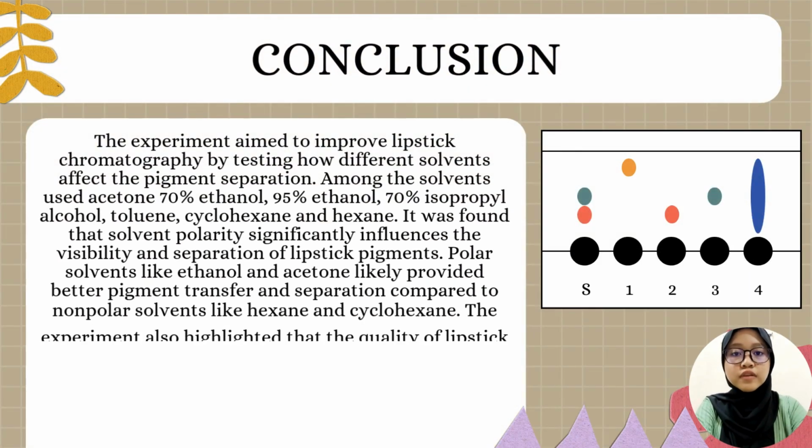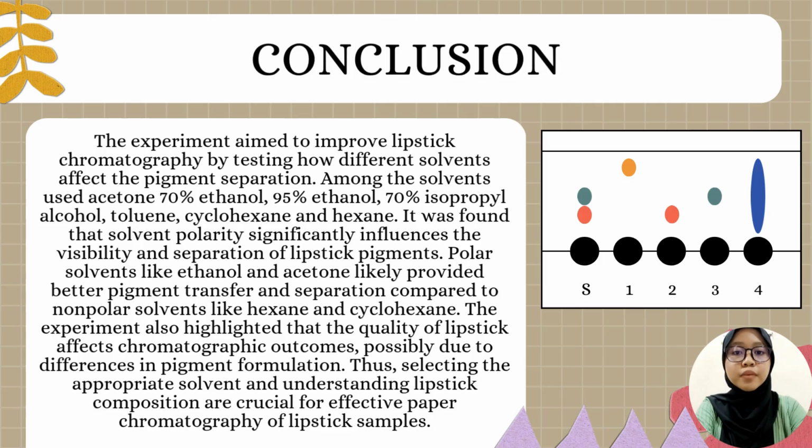In conclusion, solvent polarity and lipstick quality are both key factors in chromatography. Polar solvents like ethanol and acetone perform best, and high quality lipstick gives better separation. This experiment shows how important it is to choose the right conditions when analyzing cosmetic products using chromatography.